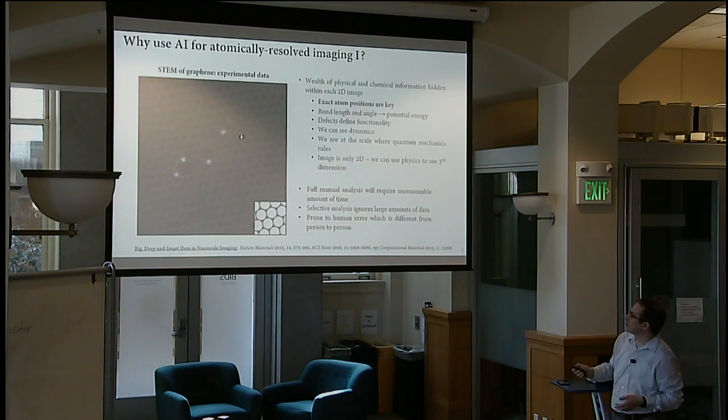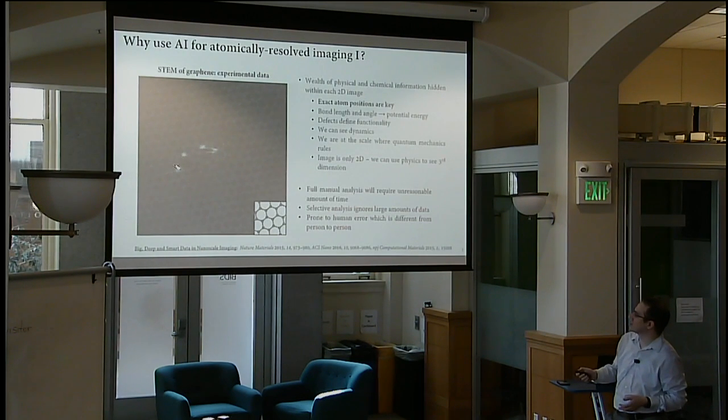Now, this lattice gets reconstructed in some areas, so you don't see hexagons anymore, you see some 5-7 and 5-8 member rings. In addition to that, you see the formation of some holes, where multiple atoms are missing. These holes get healed, they have some peculiarities in their edge shapes, and then you see some impurities jumping around these holes. And everything is happening under the electron beam irradiation. So there are lots of very interesting physical and chemical processes happening here.